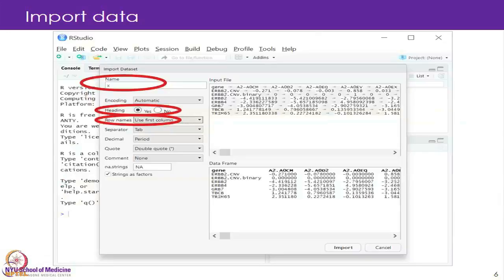The important thing when you open the data file is to change the name and call it X, just so that it is short. You should click yes on the heading, so it will take the sample names as the column headings. And you should select to use the first column as the row name — those are the gene names. The data is a small dataset: 77 breast cancer samples from CPTAC that you have seen before.